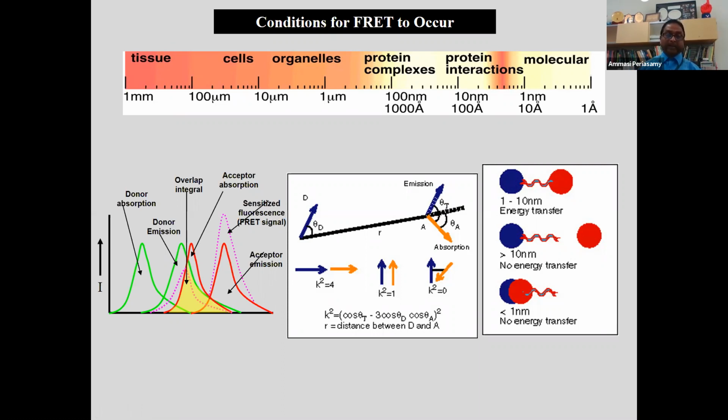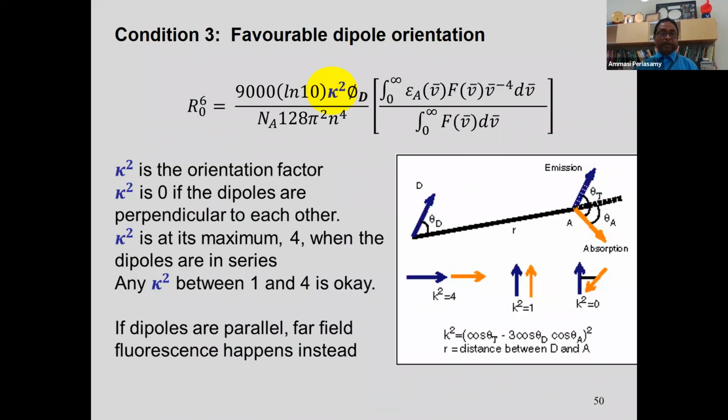So this is a very important parameter, the dipole moment. Even if you select an appropriate fluorophore pair that overlaps donor and acceptor, the molecules should have the right distance. When you choose the protein molecules to investigate, you should know that the distance between the two molecules is close to 10 nanometers, and the dipole moment is another story: whether the donor dipole can find a partner in the acceptor absorption dipole. That's a very important parameter to achieve the FRET signal. So this is the R0 value.